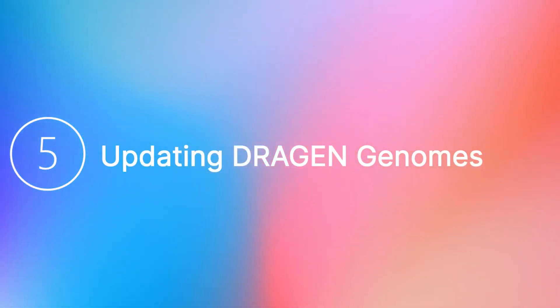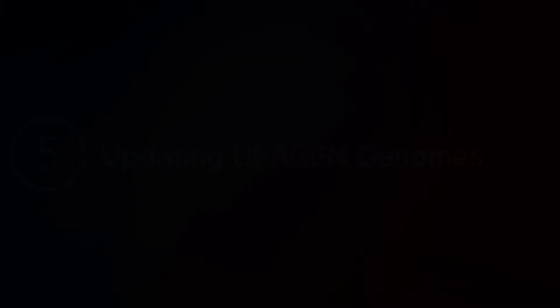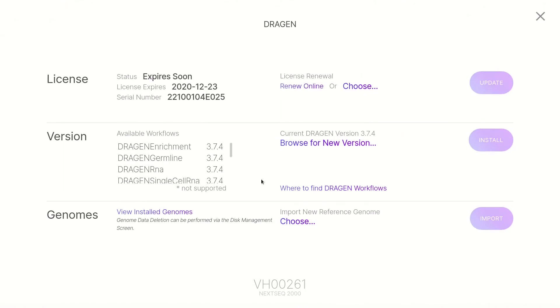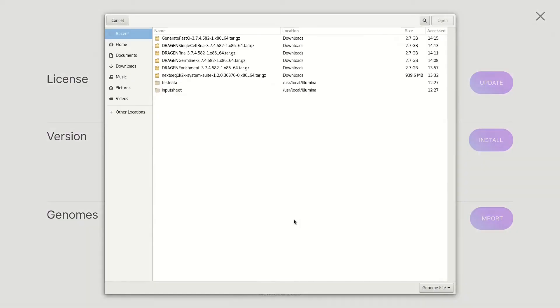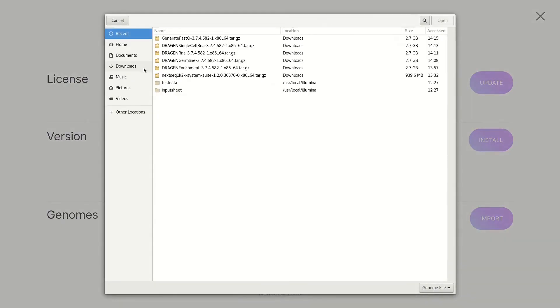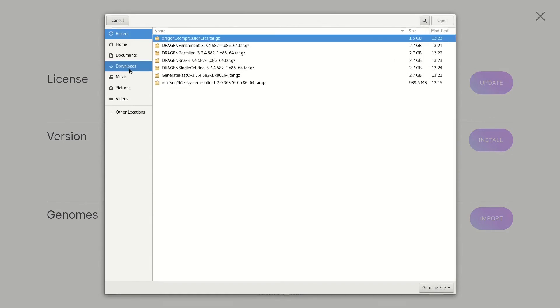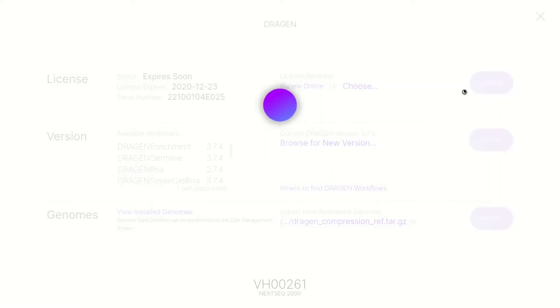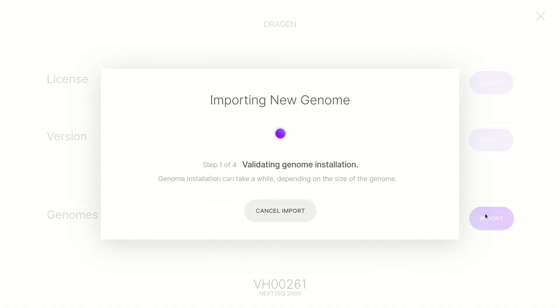Step 5: Updating the DRAGEN Genomes. Continue onto the DRAGEN screen. Under Genomes and Import New Reference Genome, select Choose. In the Browse window, navigate to the folder location of the previously downloaded files. Choose the DRAGEN compression ref file and double-click. Next, select Import. The control software displays a busy indicator during installation. Once successfully installed, click Done.